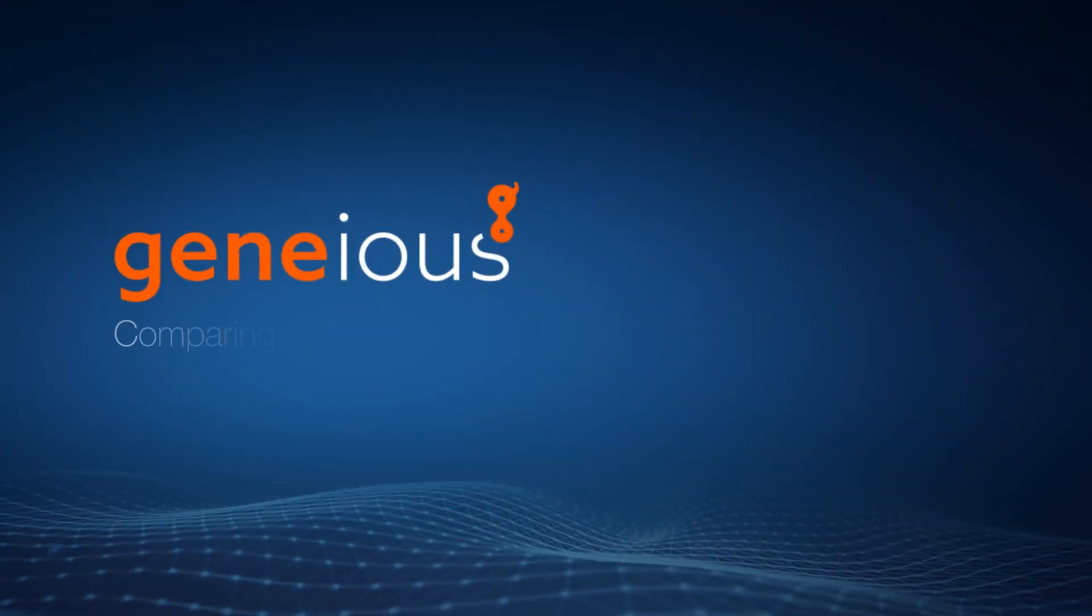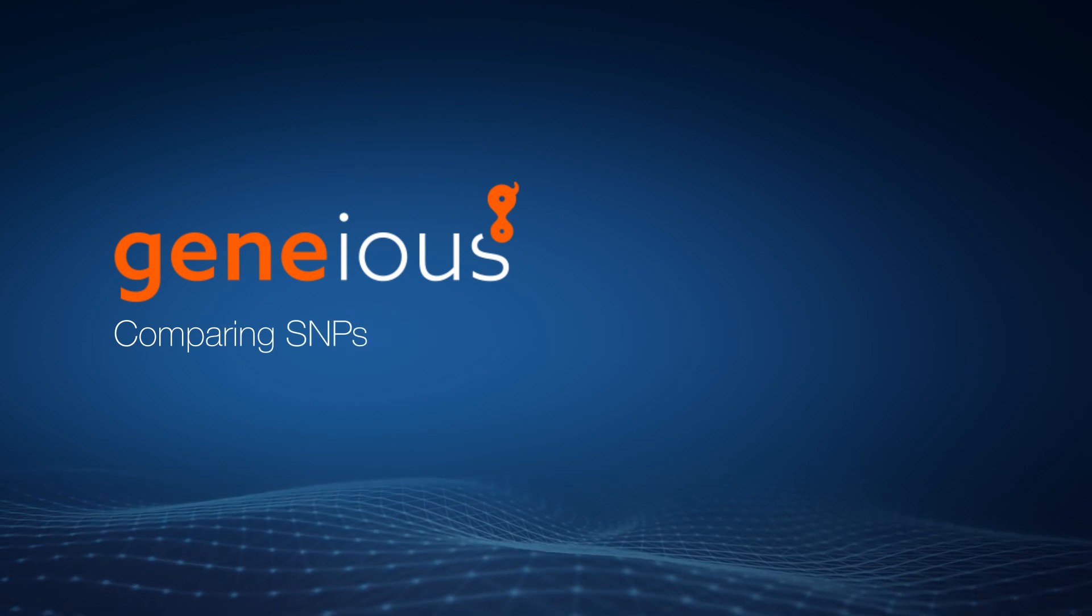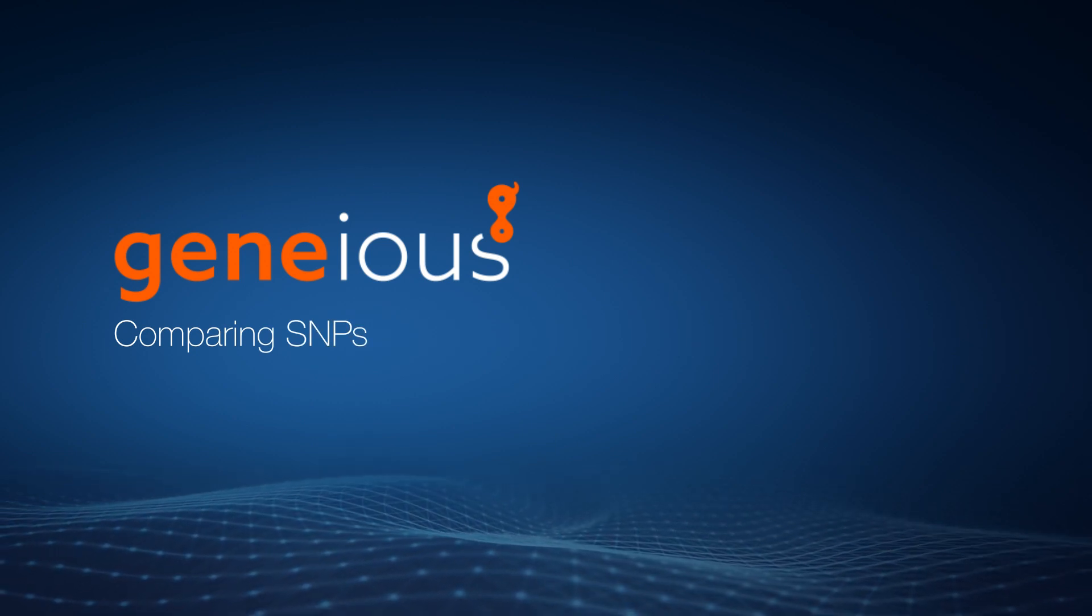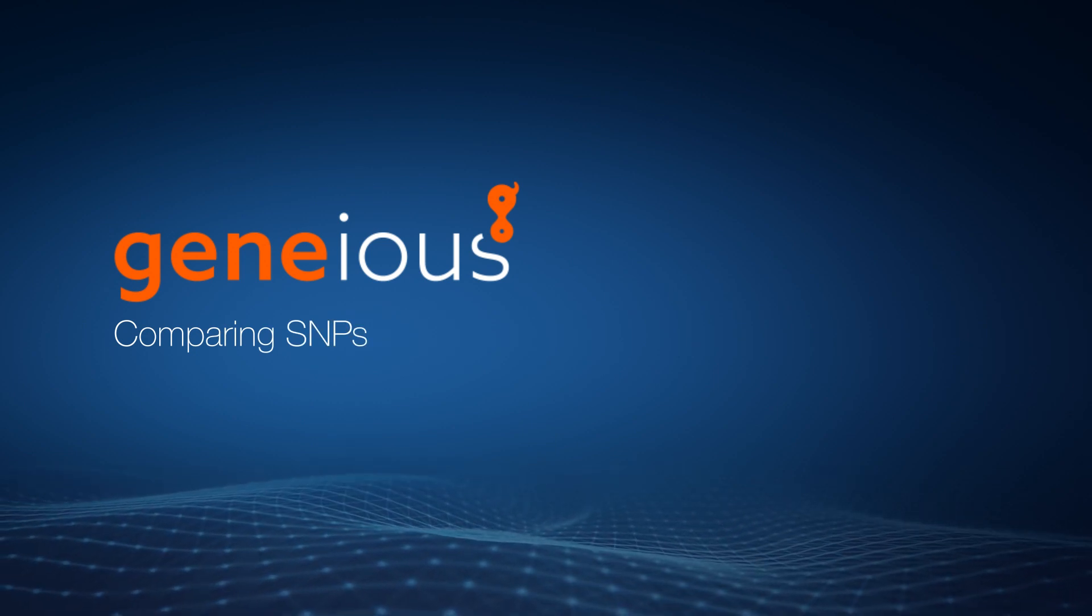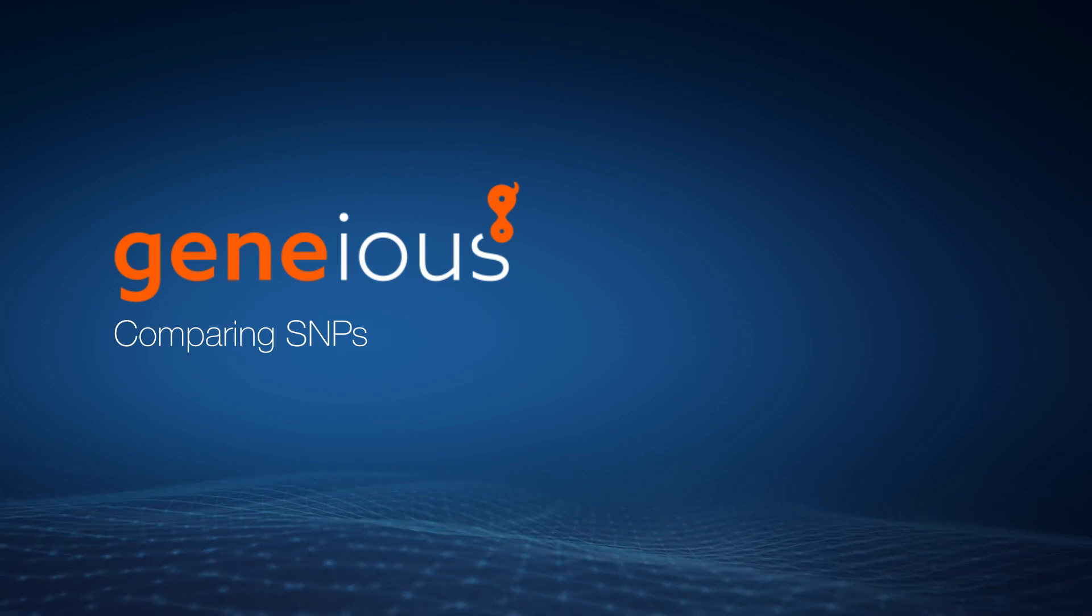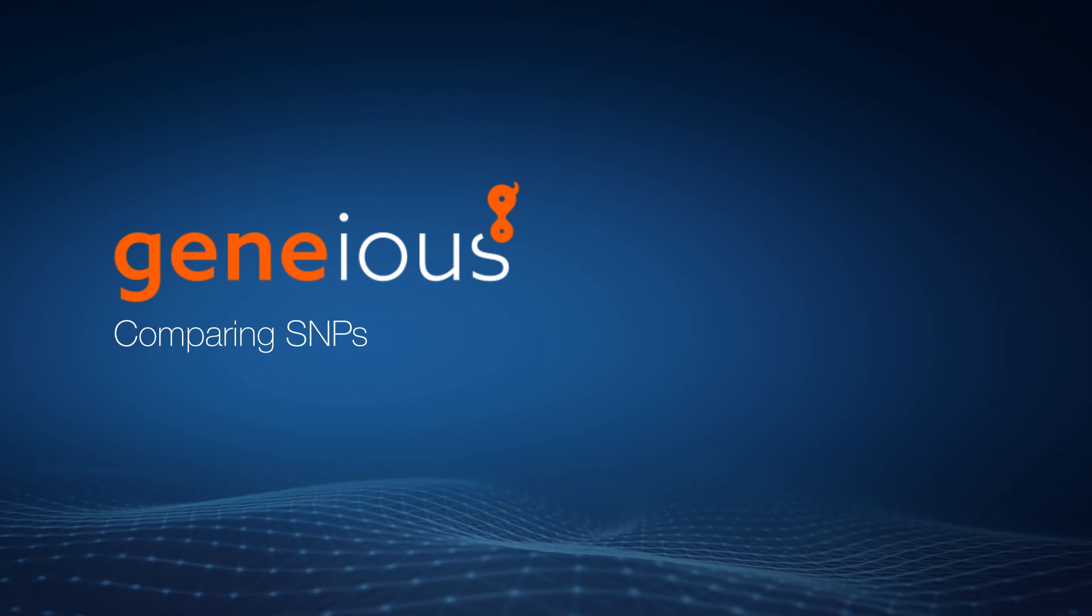Welcome to this video on comparing single nucleotide polymorphisms with Geneious Prime. Refer to the Calling SNPs video to learn how to call SNPs before comparing them.